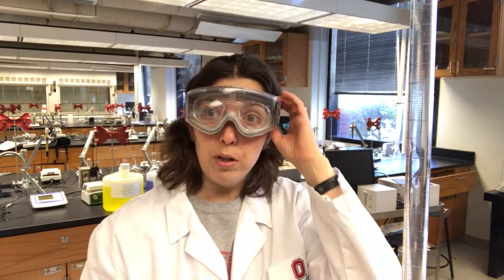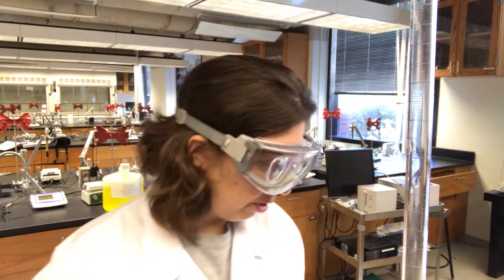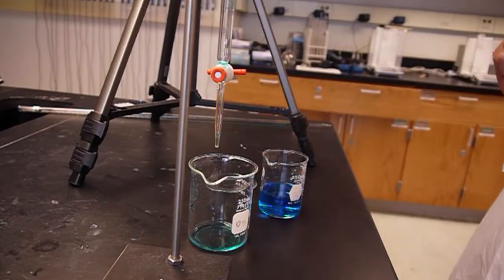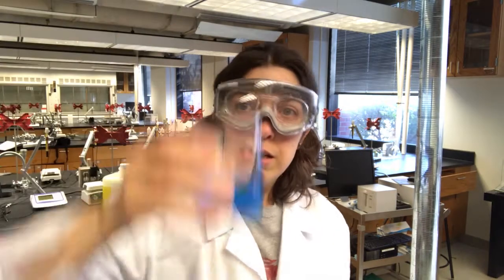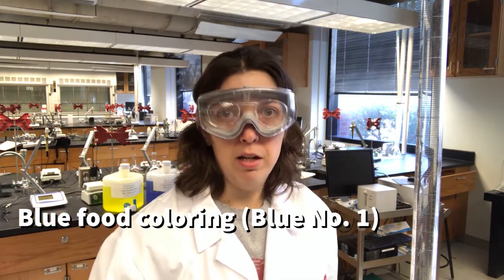So the first thing we're going to want to do is rinse the Buret. So what I'm going to do is make sure that the stopcock is closed, and I'm going to add a small amount of solution to the Buret. Now we want to rinse with the solution that we're going to actually use in our Buret. Today I'm just practicing with some blue solution. It shows up nicely on the camera.